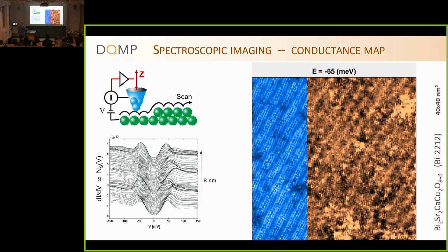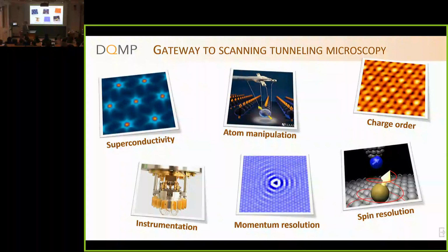Of course, images like this you can take in a few minutes. Really high resolution images like that can take days, because at each point you need to take a full IV curve, and you have to repeat this over a certain number of points.